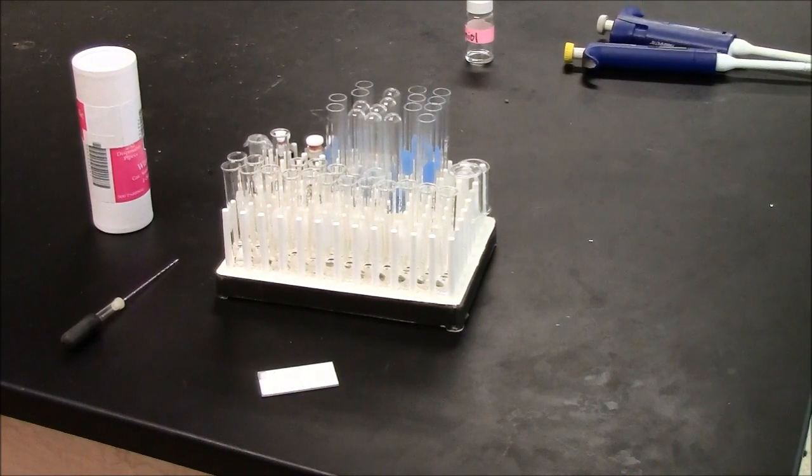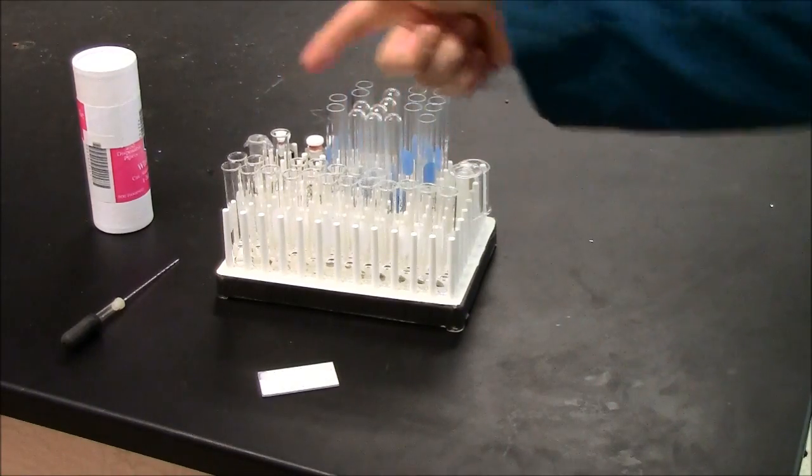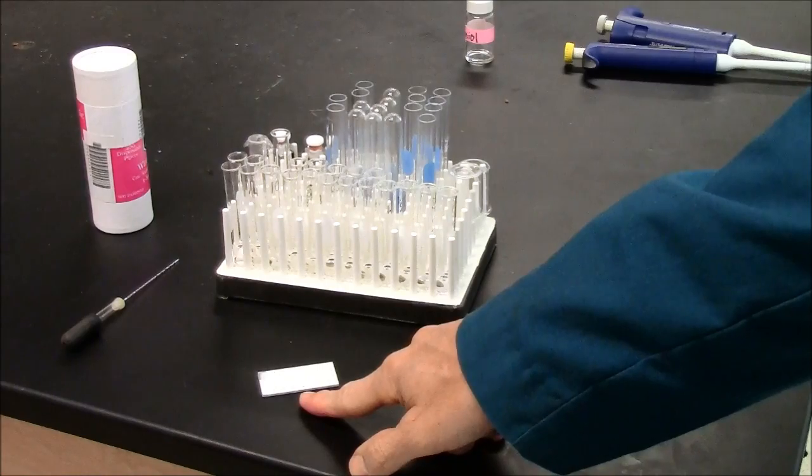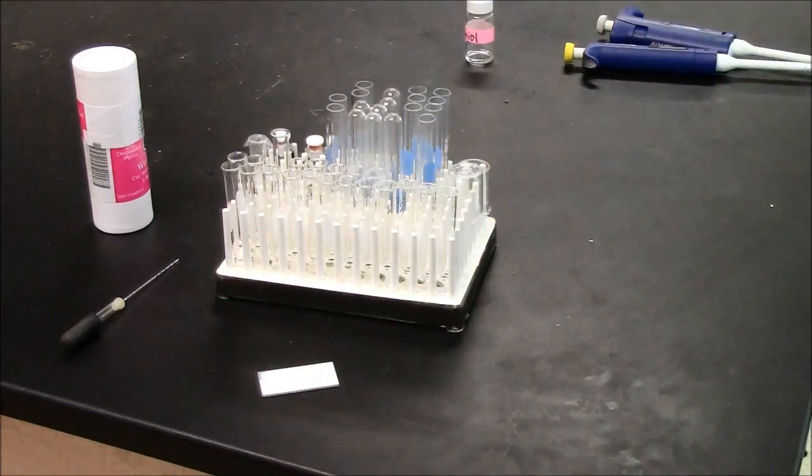After running my column, or even during the running of the column, I'm collecting many fractions, and I want to be able to do a quick screen. Is there anything in any of these tubes of interest? I can do this with one plate, one microcap. Let me demonstrate.